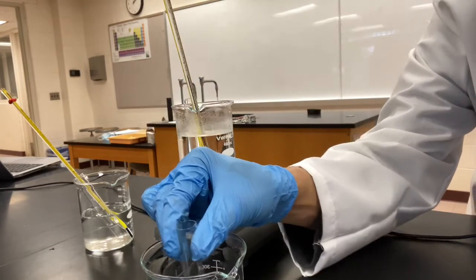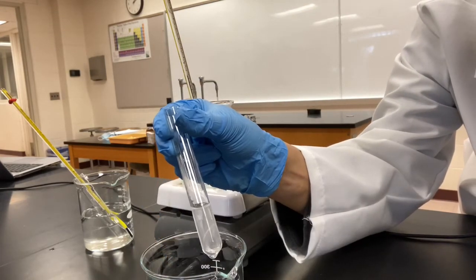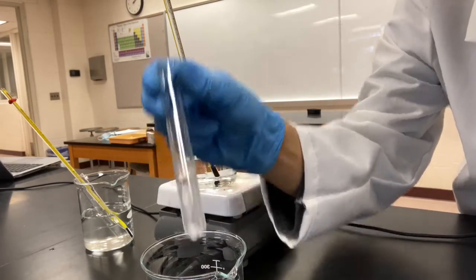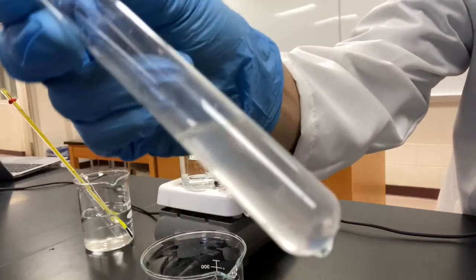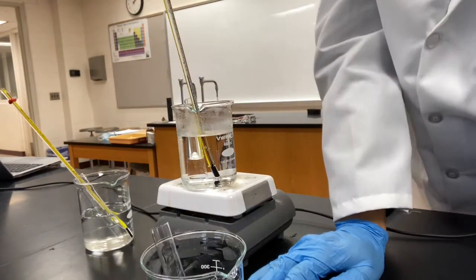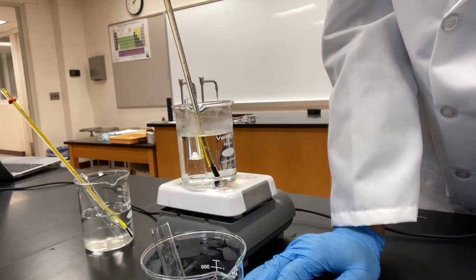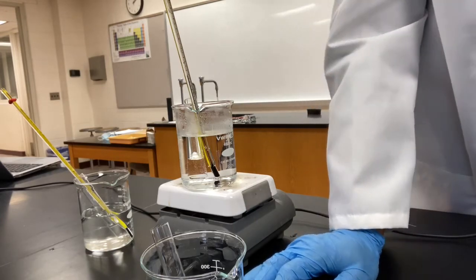Still there. It's gone. Okay. It is all gone. 9 minutes, 16 seconds. 9 minutes, 16 seconds at 0 degrees Celsius.